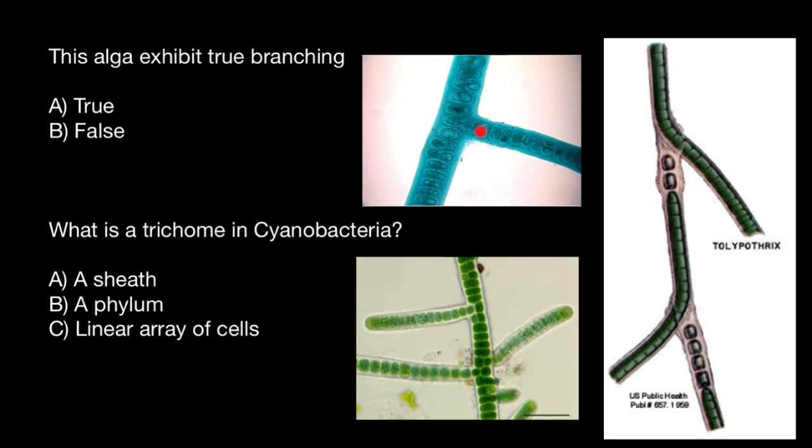And the same we see here. And the filament here is perpendicular to the rest of the cells. And as you see also here, it is perpendicular. A sheath here is not broken. Sheath is this gelatinous material. As you see here, here, but here we see a rupture of this gelatinous material. And this is a sign of the false branching.